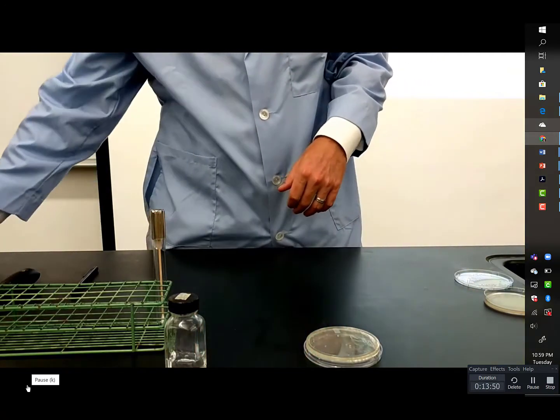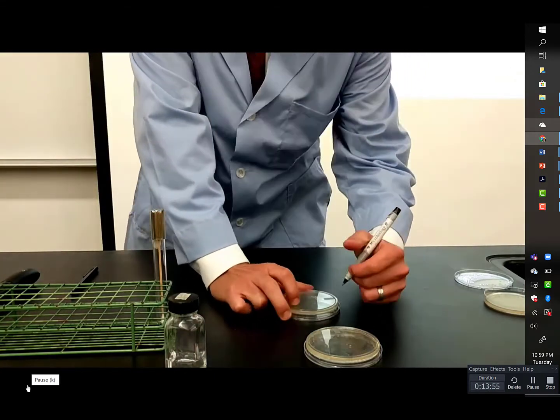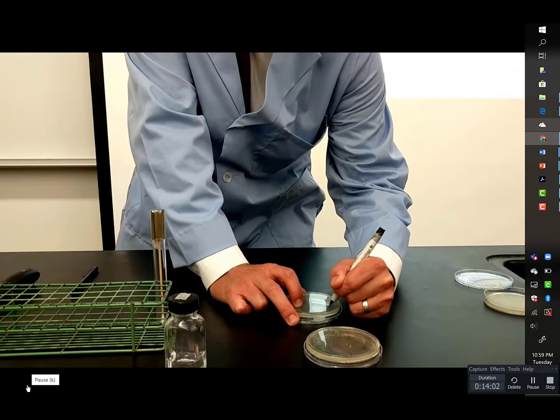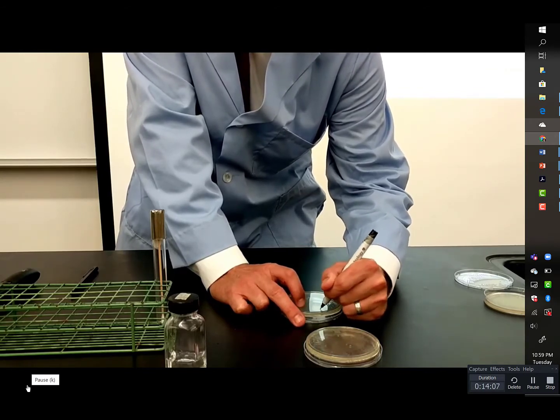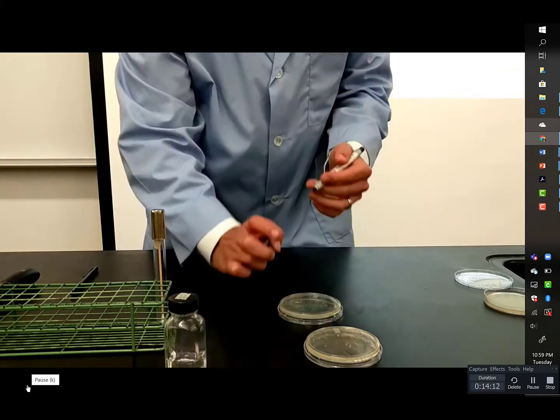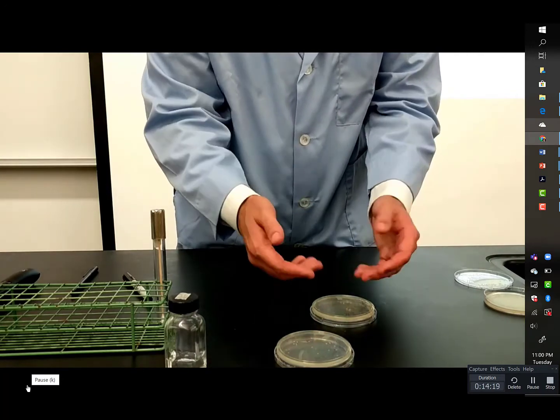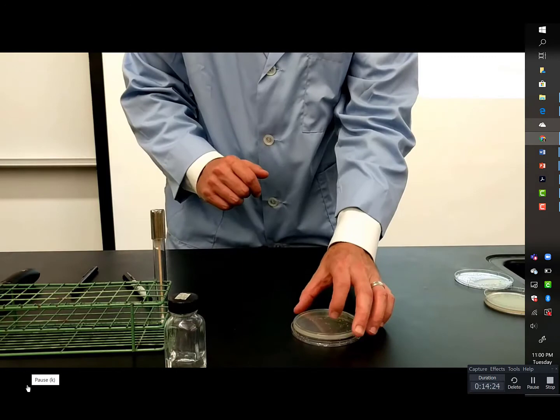Also, I would like to try another sample for good measure. Let's try, how about a shoe? How about my left shoe? Why not? So I'll go ahead and sample the bottom of the shoe. All right. I would expect that we're going to get a very different sample from the cell phone, which I'll set aside over here, and then the bottom of a shoe.